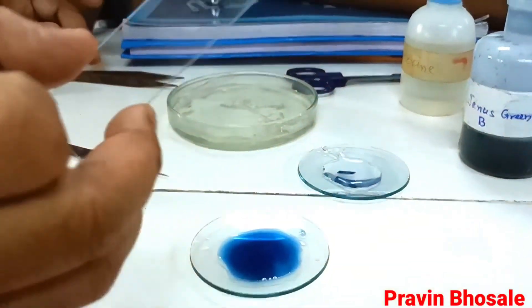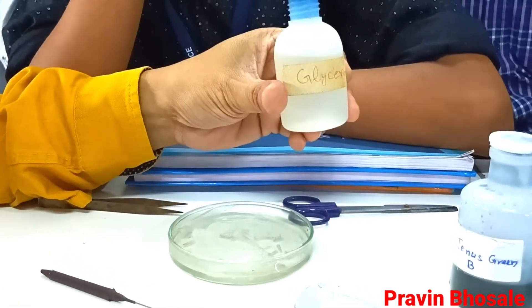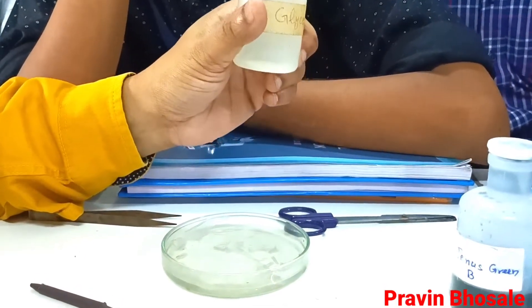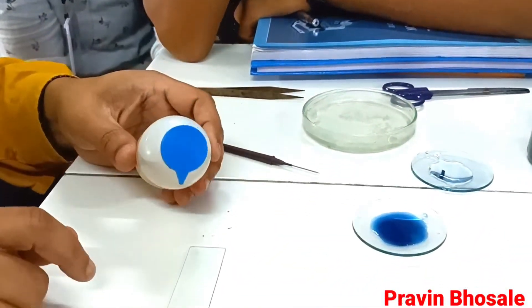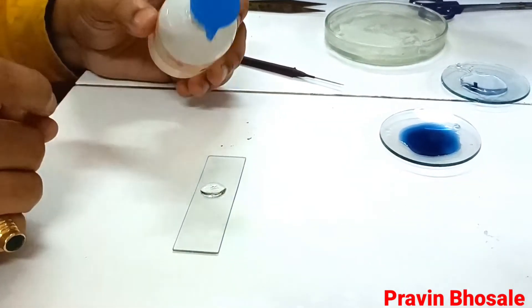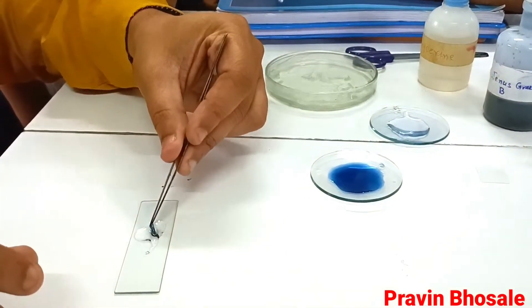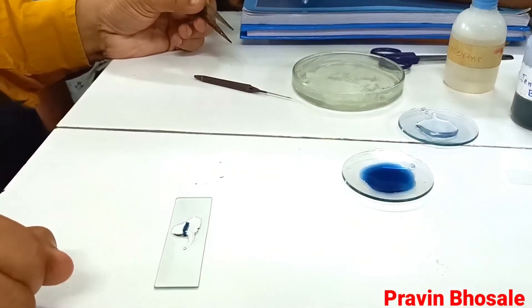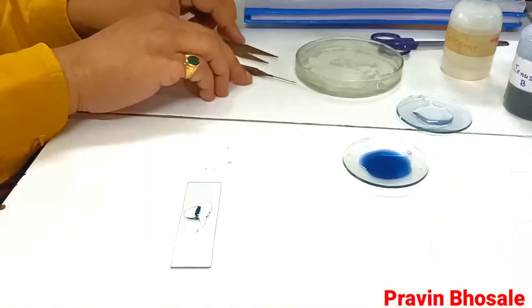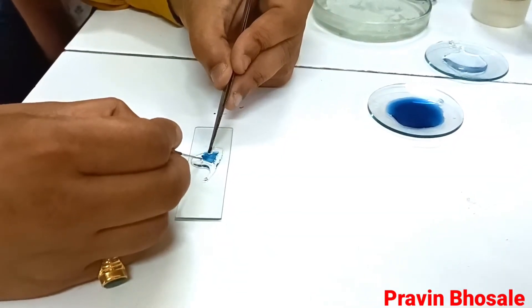Now take the slide, and on this slide take an adequate amount of glycerine. Glycerine is a mounting medium. Why do we take glycerine? The refractive index of glass and glycerine is the same, and second, it prevents dehydration. Now transfer the onion peels onto the slide containing glycerine and make it unrolled, because the onion peels are actually folded. So with the help of a forcep and needle, make it unrolled.